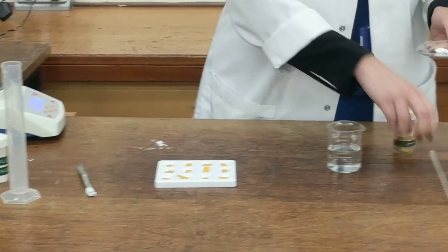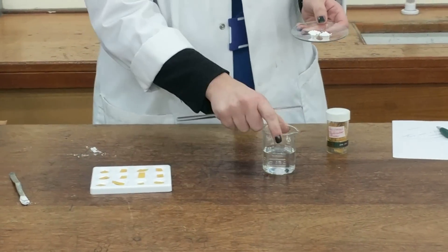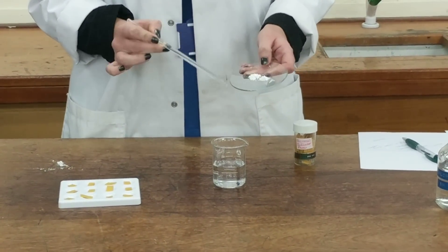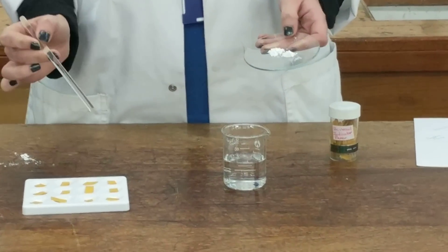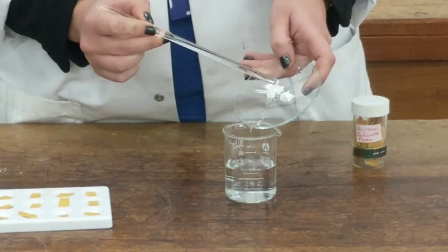So we're going to add the first slot of calcium hydroxide, 0.3 grams, stir and put a little bit of it onto the universal indicator paper.